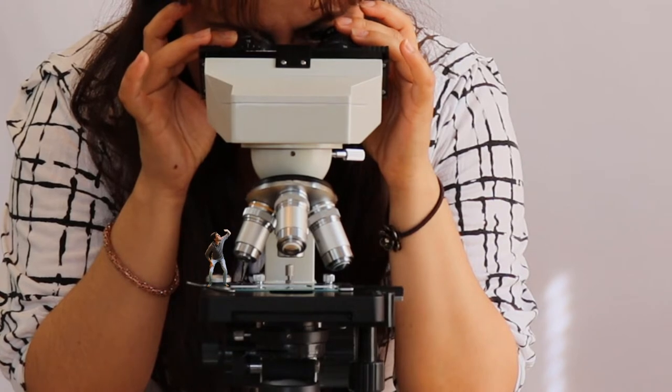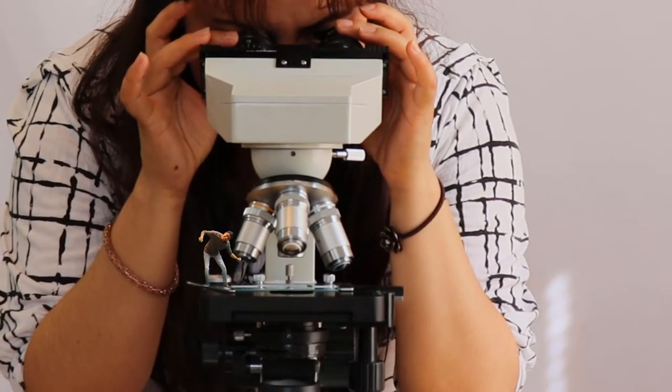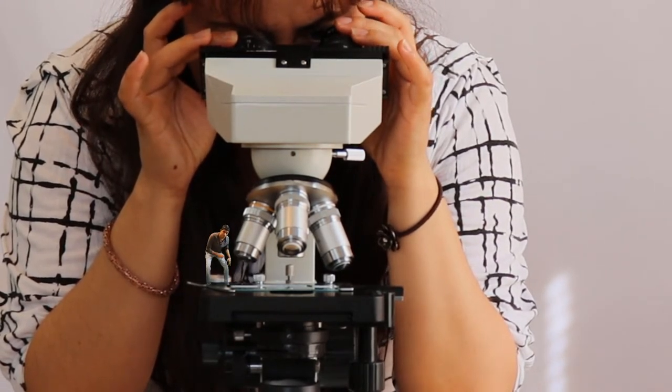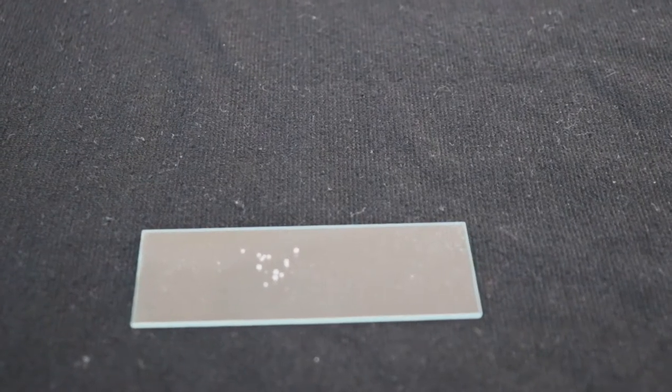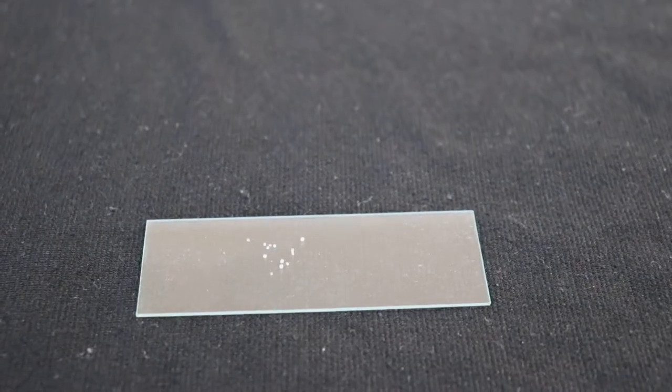I'm in the microscope! Yeah, let's go and see the salt in the microscope. Okay, this is regular salt. This is what you're gonna see on the microscope.